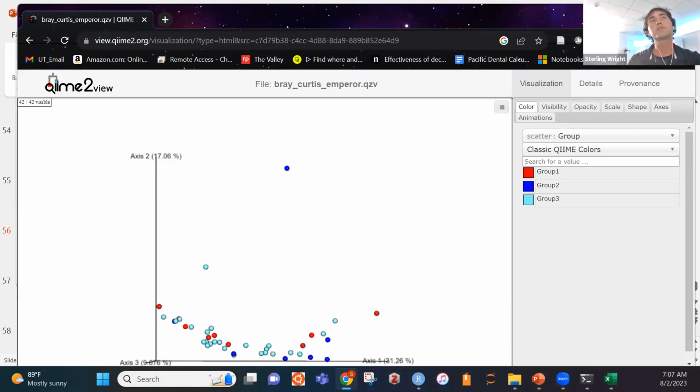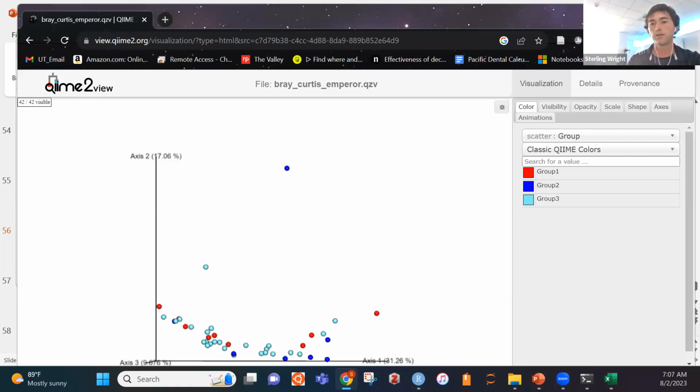All right, so let's go ahead and run a PERMANOVA test. Oh, no problem. I hope you enjoyed everything. If you didn't, hopefully you can maybe watch the video at some point in the future. All right, so hopefully this works.